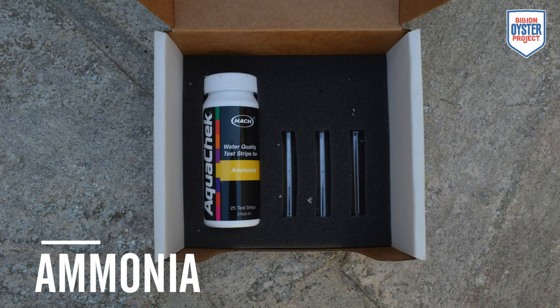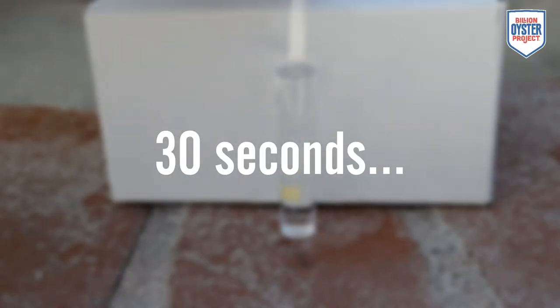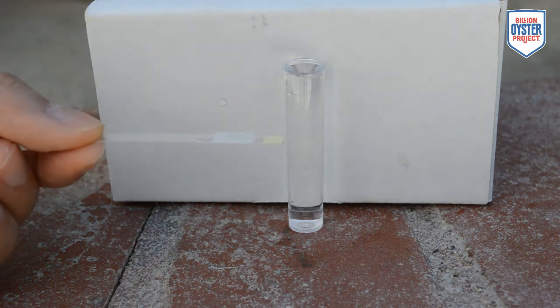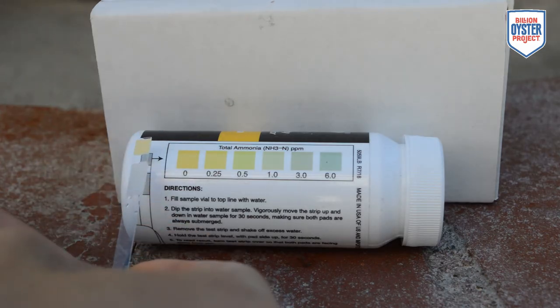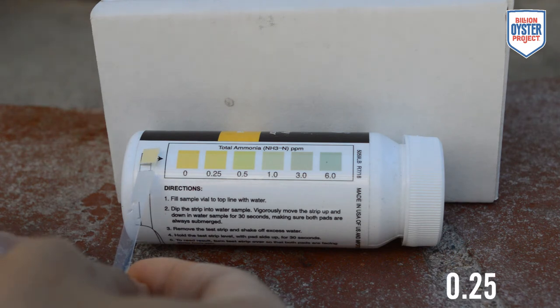To measure ammonia, we will be using Hox water quality test strips for ammonia. Fill the provided sample vial to the top line with water. Dip the strip into the water sample, moving the strip up and down in the water for 30 seconds. Make sure both pads are always submerged. Remove the test strip and shake off any excess water. Hold the test strip level, pad side up, for 30 more seconds. To read your result, turn the test strip over so that the pads face away from you. Compare the color of the small pad to the color chart provided on the bottle. Read the result through the clear plastic of the strip. Note that this test is in parts per million.